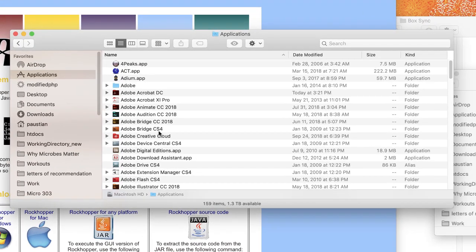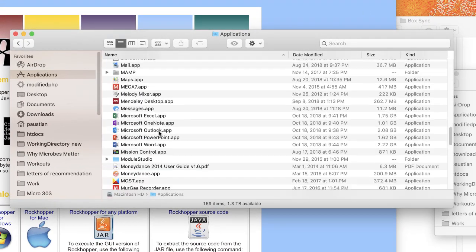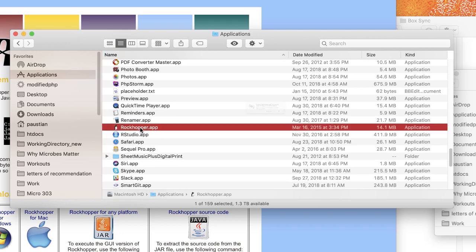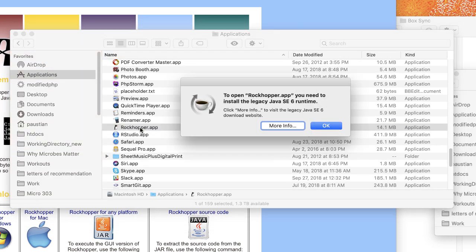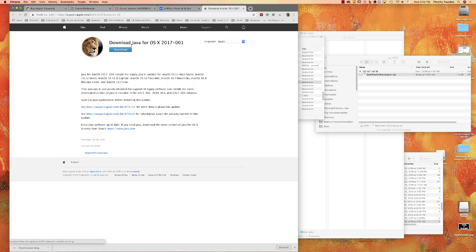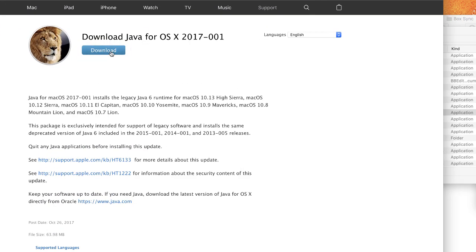I open up my applications folder and look for RockHopper. There it is — I'll launch RockHopper. You're going to get a message saying to open RockHopper app you need to install the legacy Java SE6 runtime. Click on More Info — this is going to take you to another website where you'll download an older Java that RockHopper actually needs.